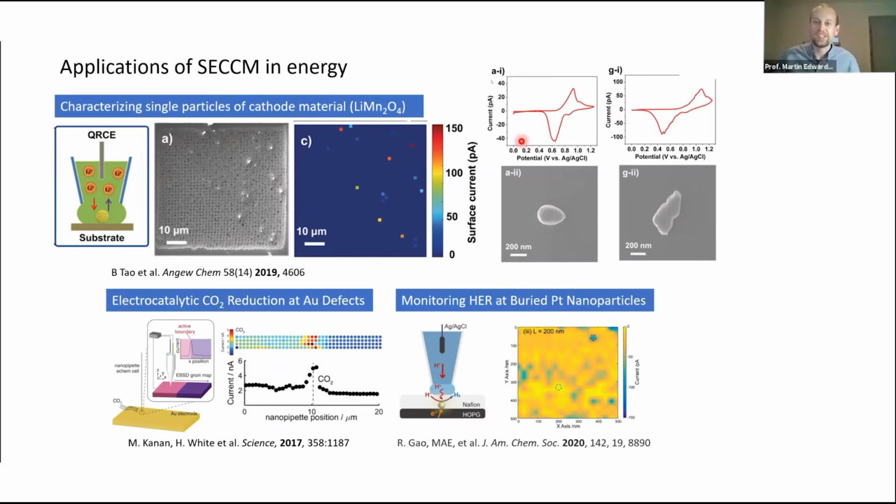You maybe have to stare a little bit at these diagrams. I apologize, they're shrunk, but the Y scale is certainly different. We're getting quite a few more ions into this particle. There's also a shift in the potential of when we can do that. And so rather than taking this lumped average approach, we can really break this down to more fundamental scientific questions and characterization. So that would be a kind of reductionist approach for looking at battery materials.